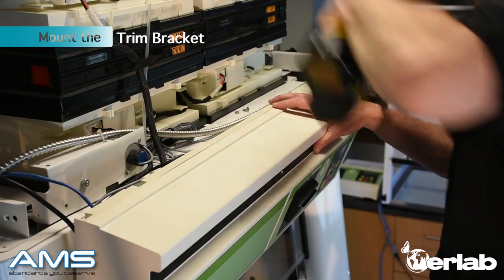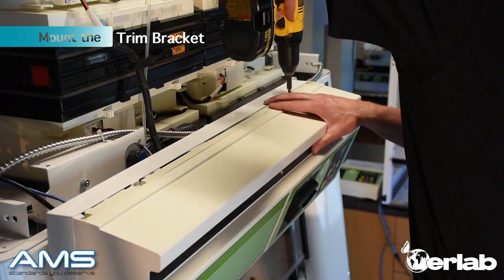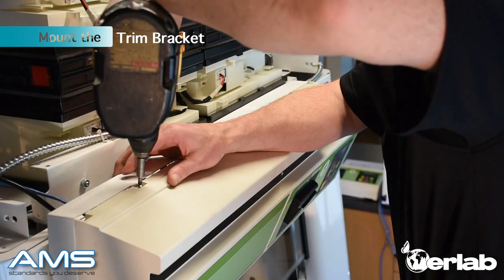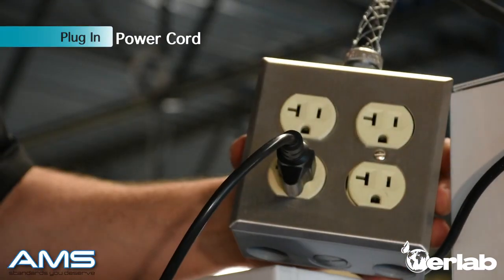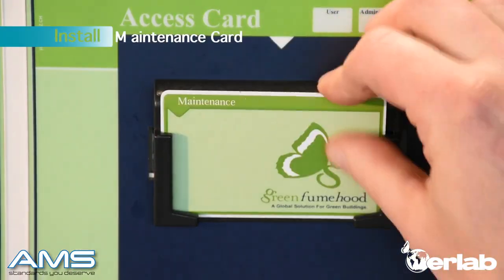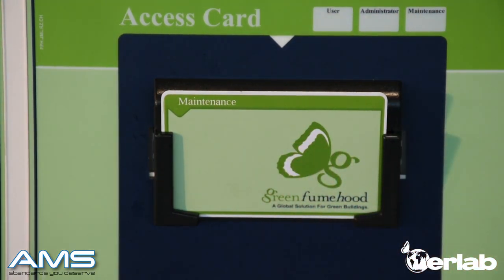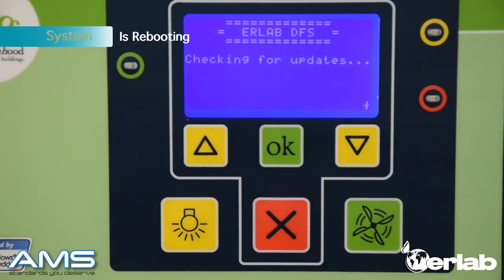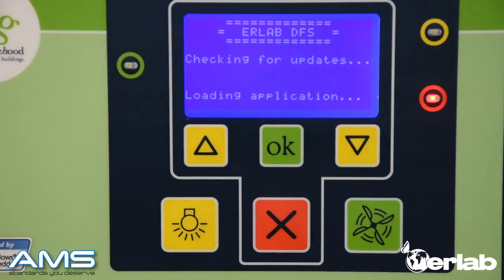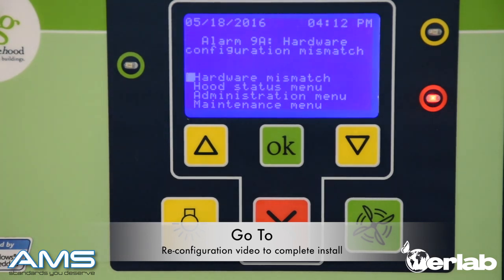Remove that single screw and mount the trim bracket. Make sure you support the command module and screw both screws into the top. Pull out your fuse, plug in the power cord, and place the green maintenance card back into the command module. Let's power back up — press your fuse back in and your screen will be illuminated. Since we installed new hardware, your screen is going to go into mismatch mode — this is correct. You will see a red light glowing and an audible alarm will go off. You are going to refer to the configuration and reconfiguration video to install the update.